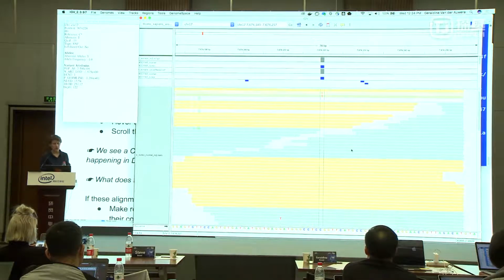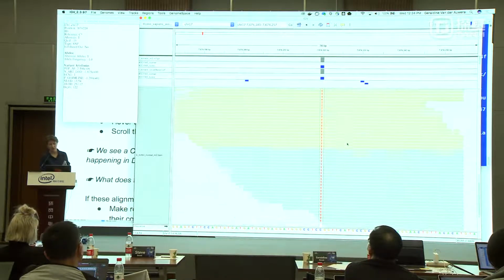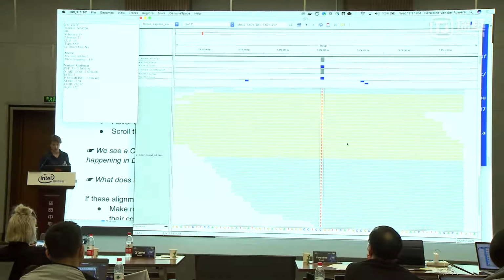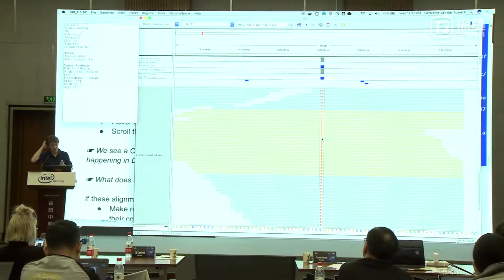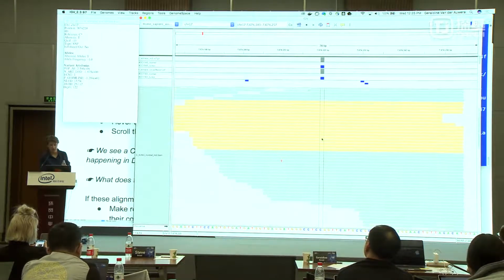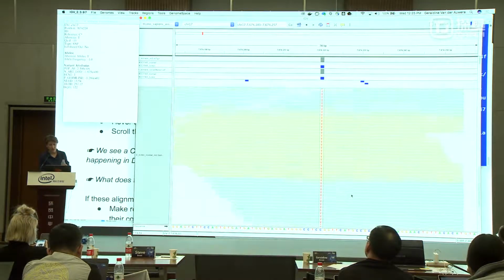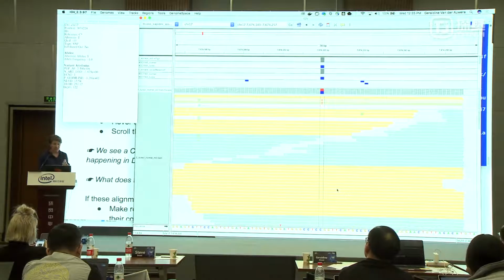Okay, so as far as Mutect2 is concerned, this looks great. It's in the tumor, it's not in the normal. But to be honest, I find it suspicious that it's completely homozygous in the tumor, but it is a site that you should take into consideration, considering the evidence that we have found.